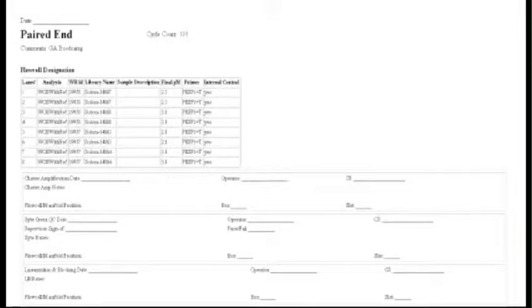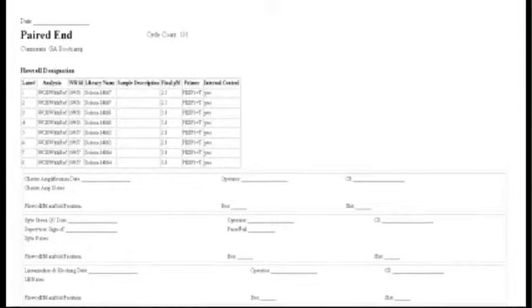These details are generally filled in by project coordinators who base them on project goals and the library concentrations determined using qPCR. These details are all tracked in our electronic LIMS as well, but it is helpful for the cluster generation technicians to have a hard copy to keep with the flow cell for referencing and for jotting notes. The lower portion of the worksheet allows us to keep track of what step of the process the flow cell is in, as well as user comments that might help in understanding the run results downstream.